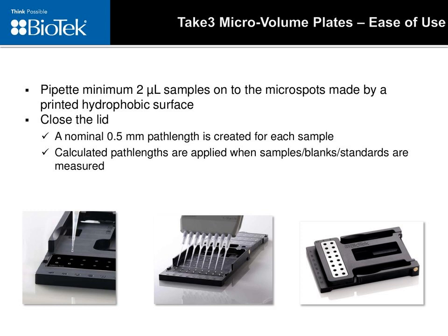While most investigators are familiar with pipetting into the various vessels, including microfuge tubes and cuvettes, the microvolume plate is a bit different. It requires a minimum volume of 2 microliters that is spotted onto a hydrophobic surface, forming a nice rounded droplet. This can be performed using either a single channel or multi-channel pipetter, depending on throughput needs and the assay being performed.